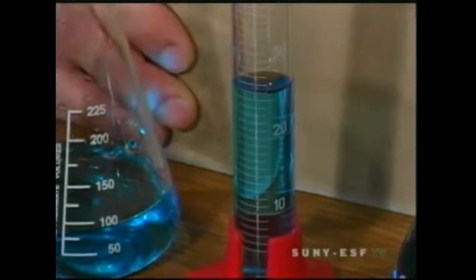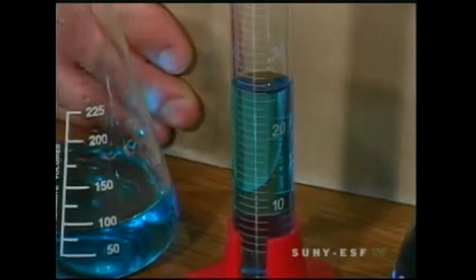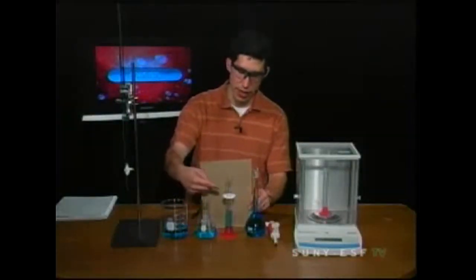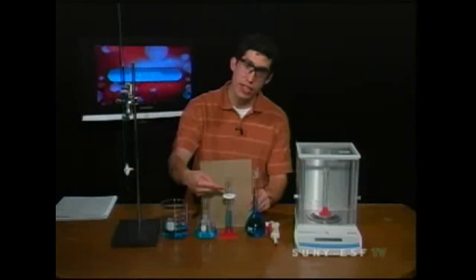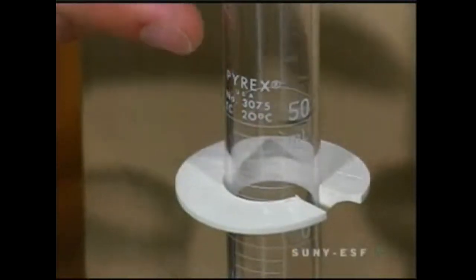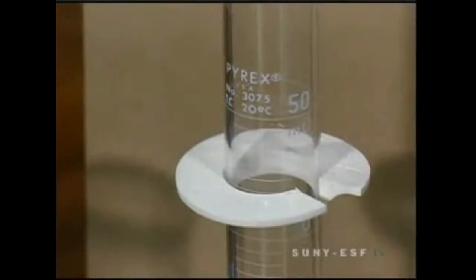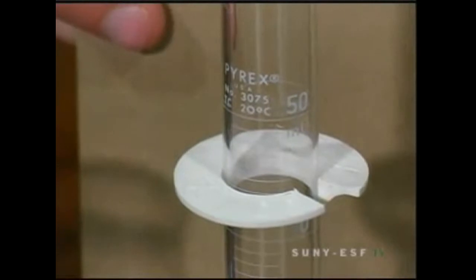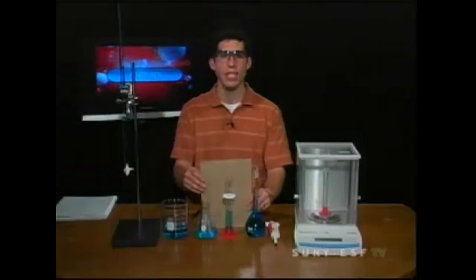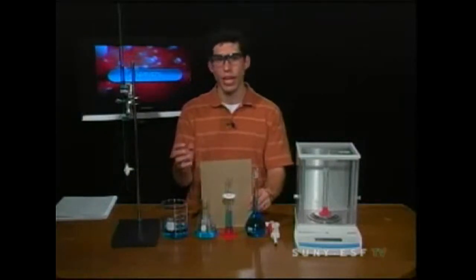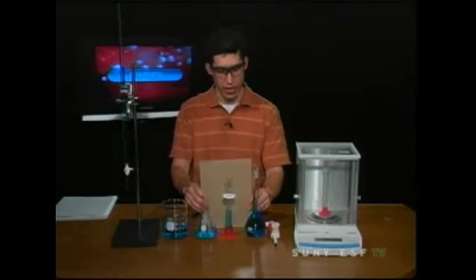What makes it even more accurate is that there's a temperature accuracy to this. We can see at the very top there's a mark that says 20 degrees Celsius. That 20 degrees Celsius mark means that this graduated cylinder was calibrated at exactly 20 degrees Celsius. And that's where it's accurate. The reason for that is because as liquids and solids heat and cool, they shrink and expand.